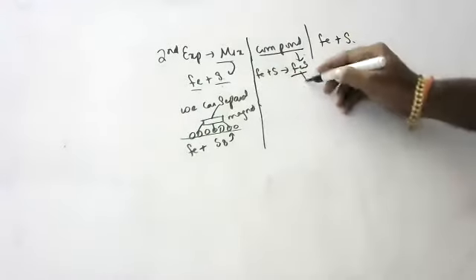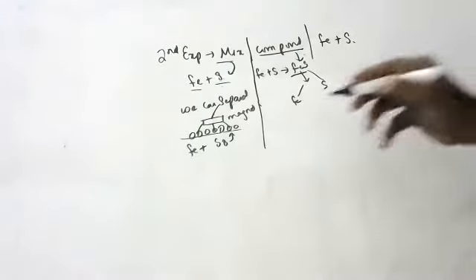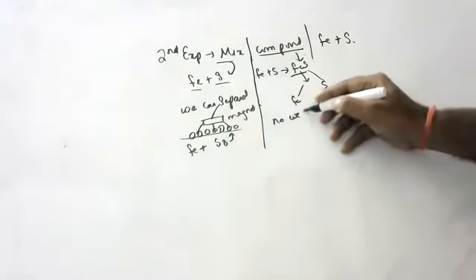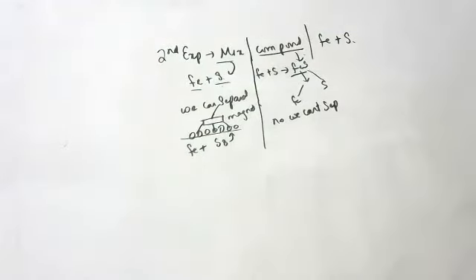But from iron sulphide, can I separate iron and sulphur, children? No, sir, we can't separate. It is a compound.